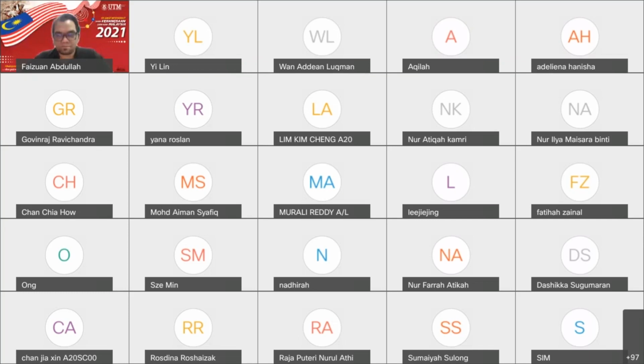You have told us the answer, right? How much? 10 mil. Okay, so is it possible to take 10 mil by using the pipette and transfer into the 100 mil volumetric flask to prepare 0.1 ppm?